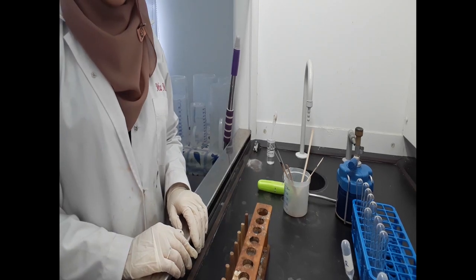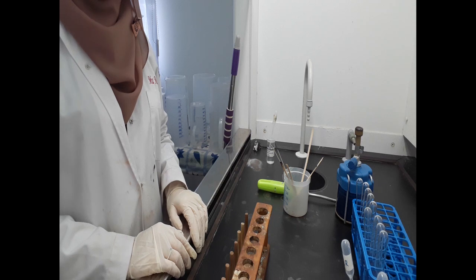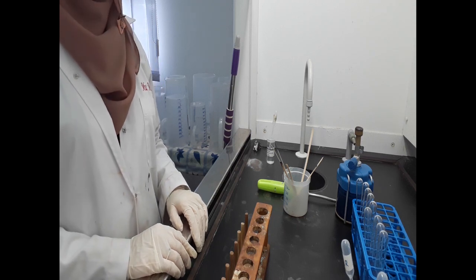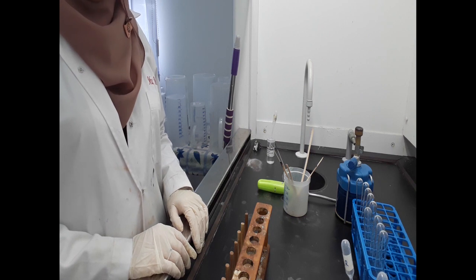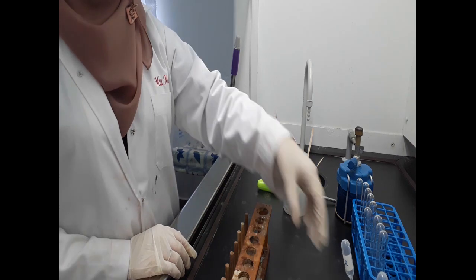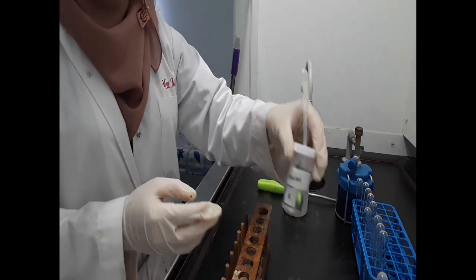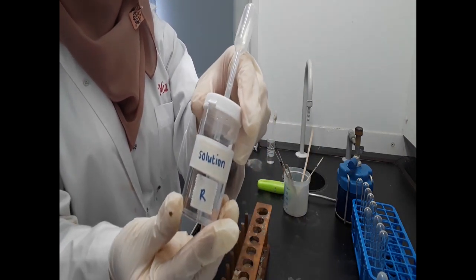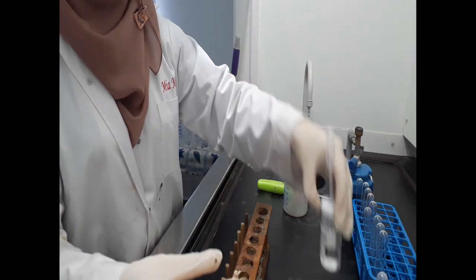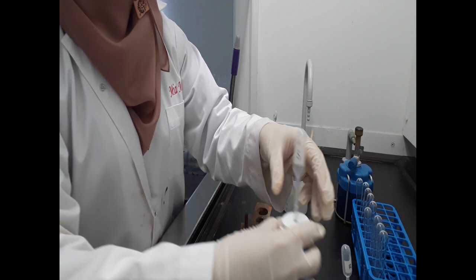Hi everyone, today we're going to do a November 2017 practical exam on qualitative analysis. This video will include some of the tips and tricks on how to answer this question. So let's get started. We're given two mysterious solutions, solution R, which is a colorless solution, please take note of the color, and solution S, which is a blue solution.